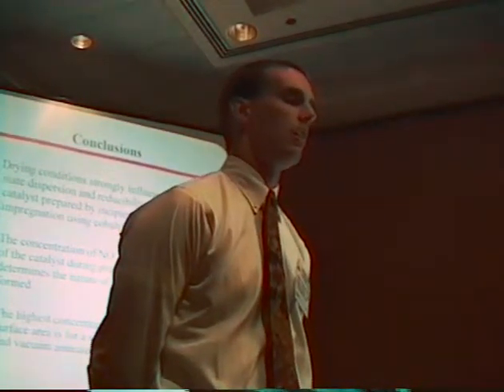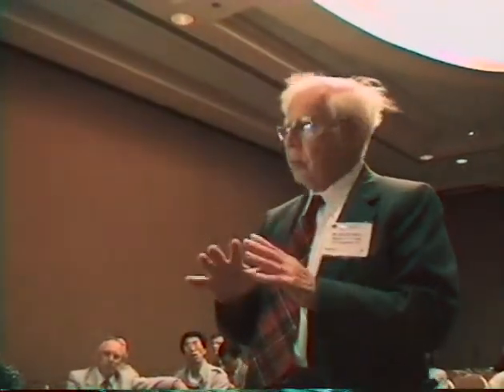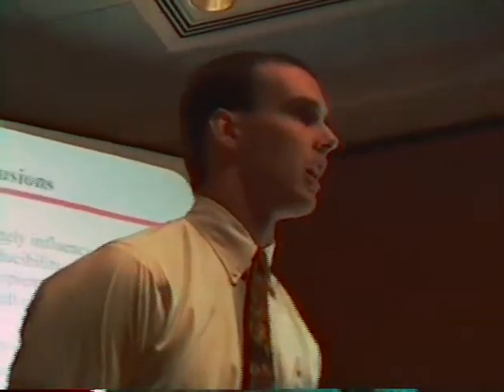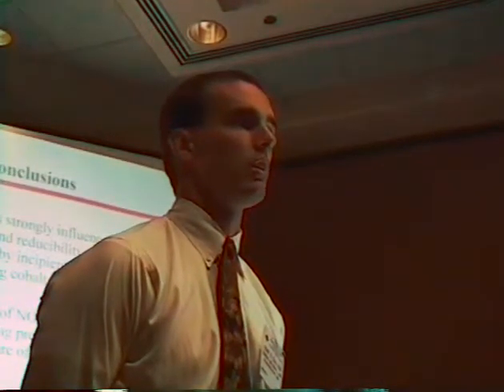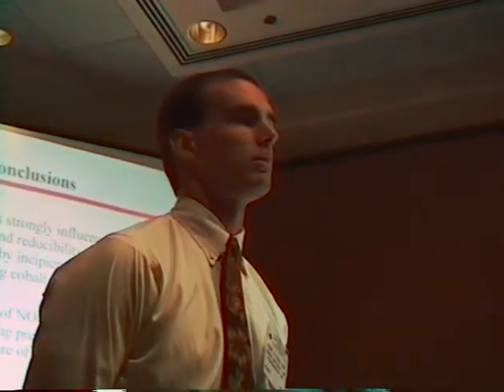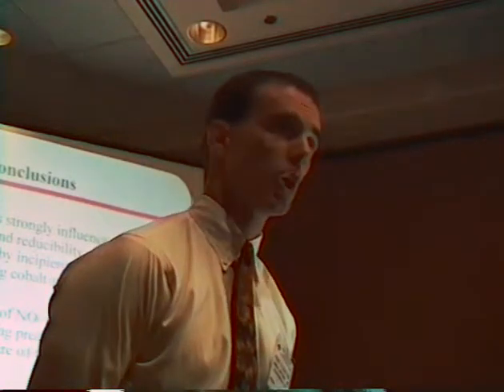Yeah, Keith? Just to follow up on Al's question, I take it these times when you don't see CO absorb are taken at room temperature. The spectrum that I showed you, we also did some at low temperature. That's what I was going to ask you. Yes. Do you find the same observation at low temperature? Yes, we do. We are only able to go to about minus 100 C. We still don't see it. So this sort of supports Al's idea, because at low temperature you wouldn't expect it to dissociate CO so readily.